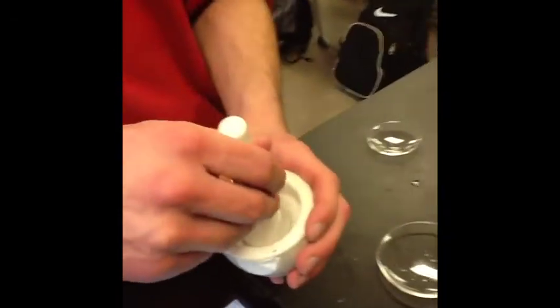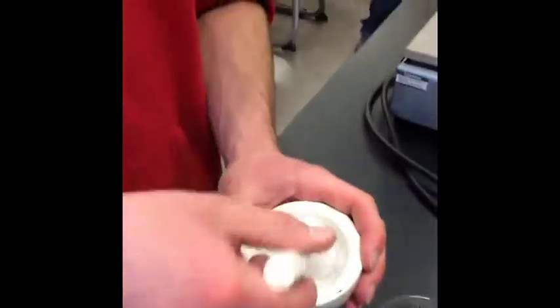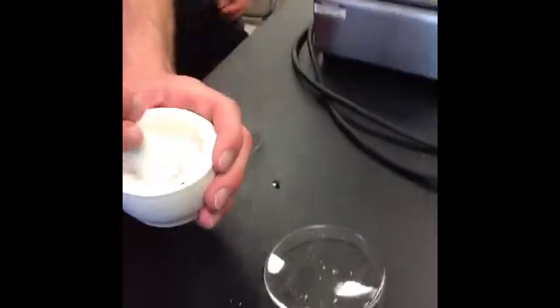There we go. Alright, so here we are. We take our salt here and crush it up in this mortar and pestle. We're just doing this so we can fit it in this tube, and we can heat it up in this water bath. And we can find out the melting temperature and hopefully find out what we made.